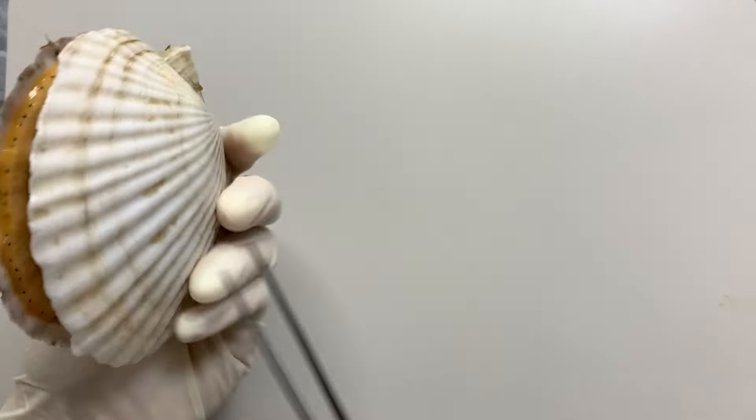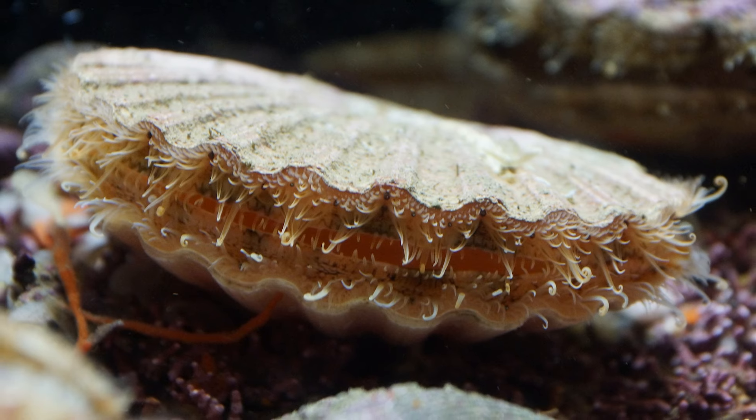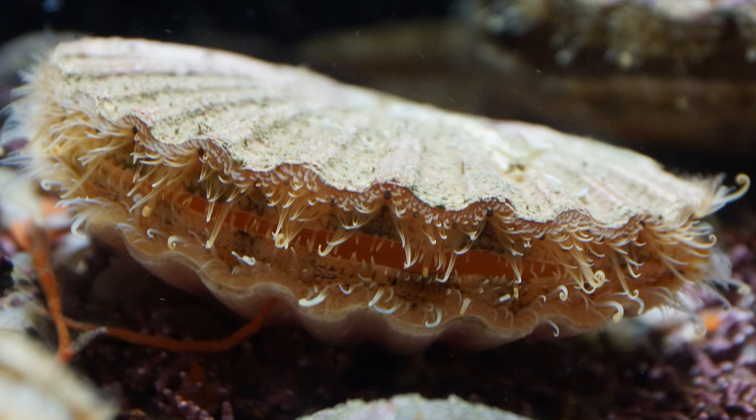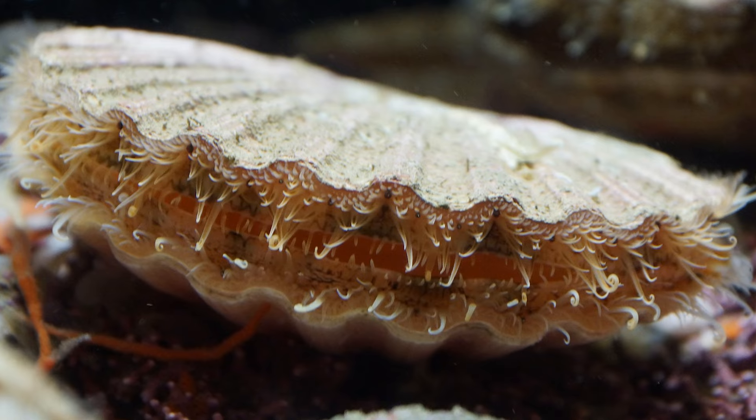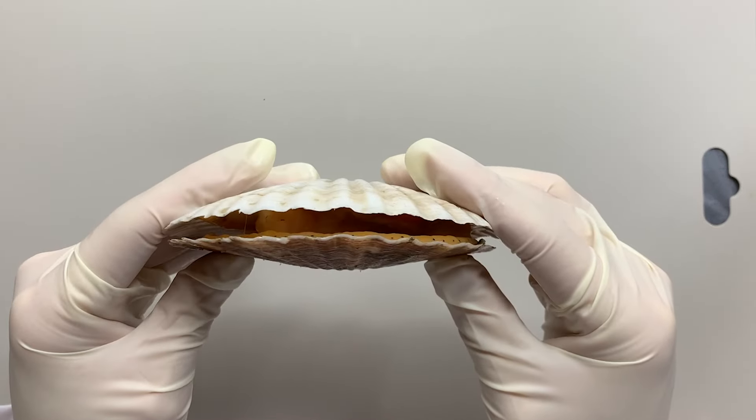Scallops look similar to other bivalvia. However, they are unique because they have many differences in lifestyle and body structure from other bivalvia. Let's focus on these characteristics of the scallops.